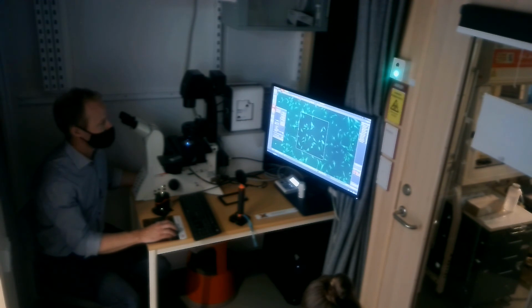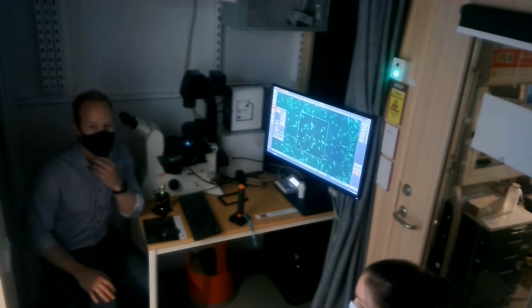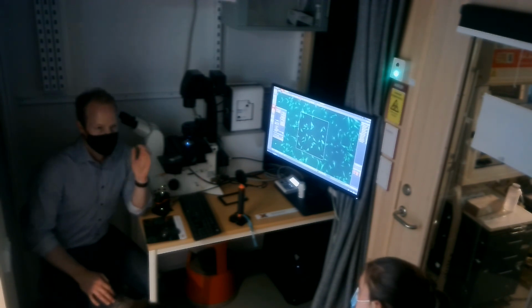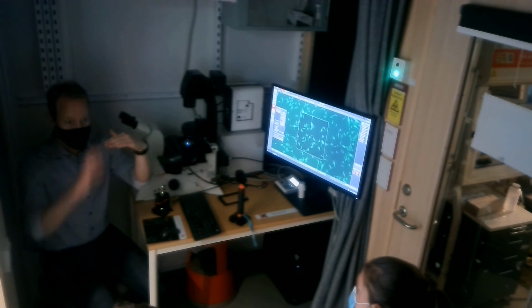But my main point here was that you can add a Z dimension to these experiments very, very easily. If I use a focus map, for example, then the Z stack will be automatically changed between positions. The focus map will always point to the point in focus, which will always be the middle of the stack.